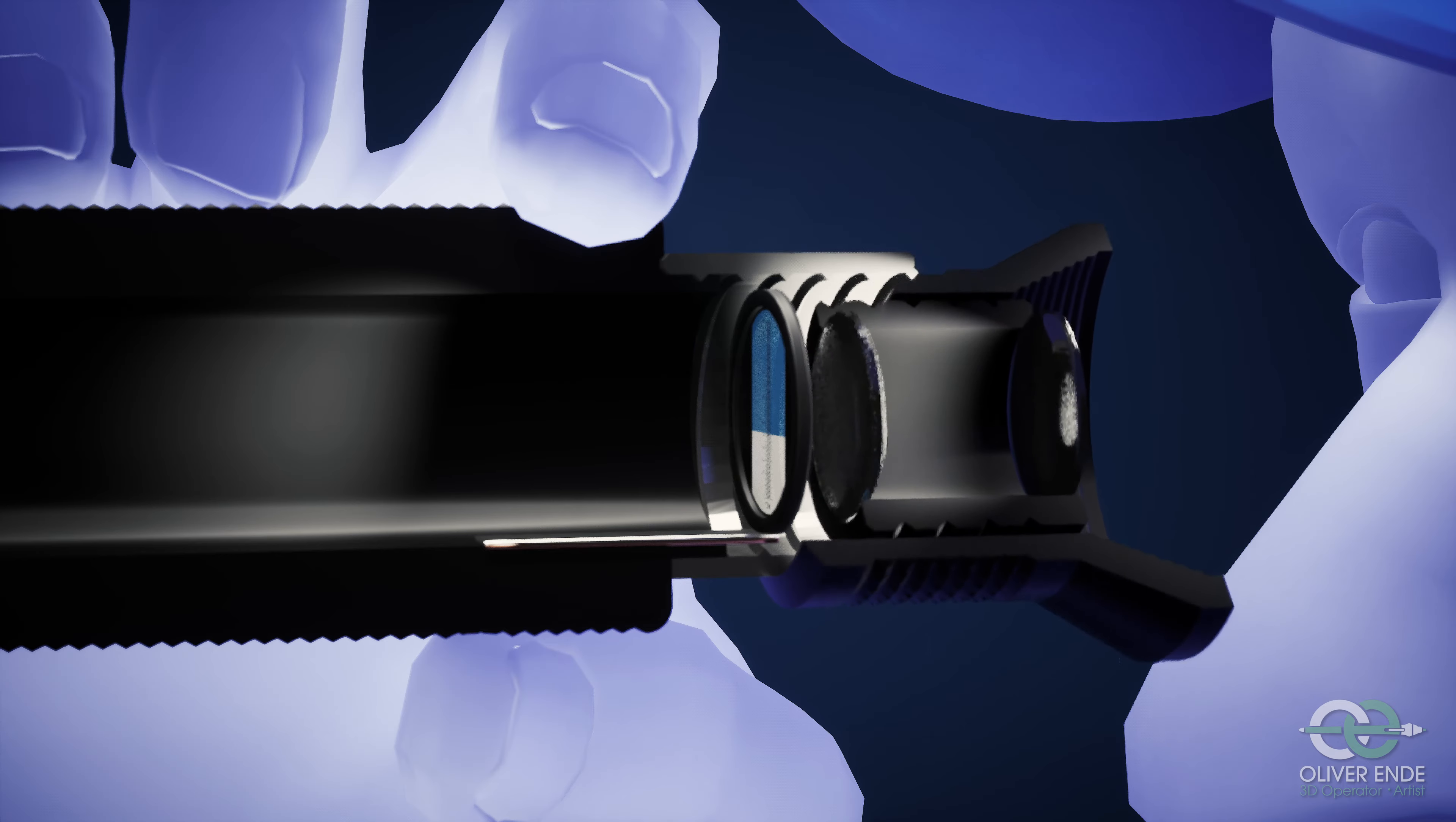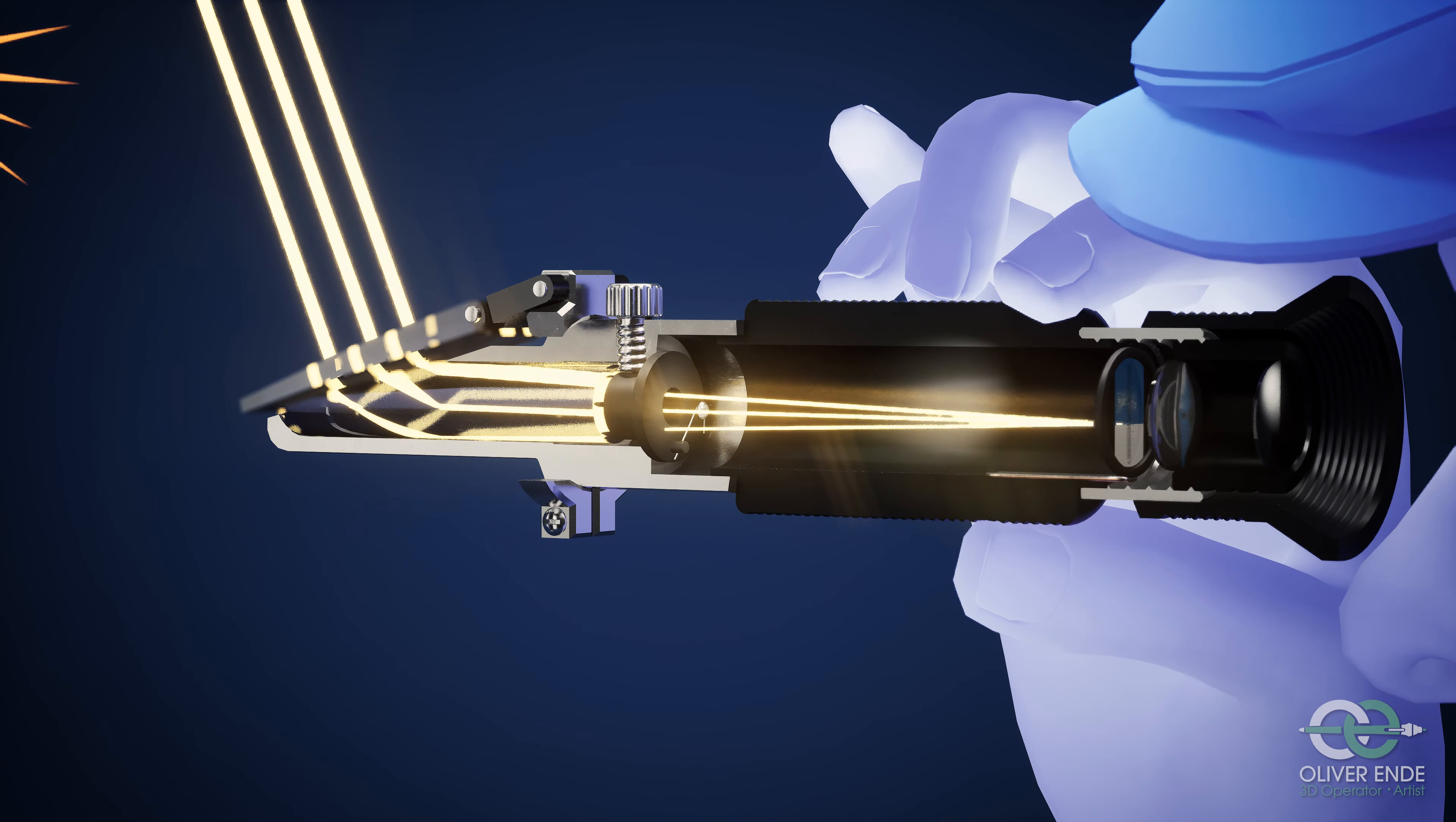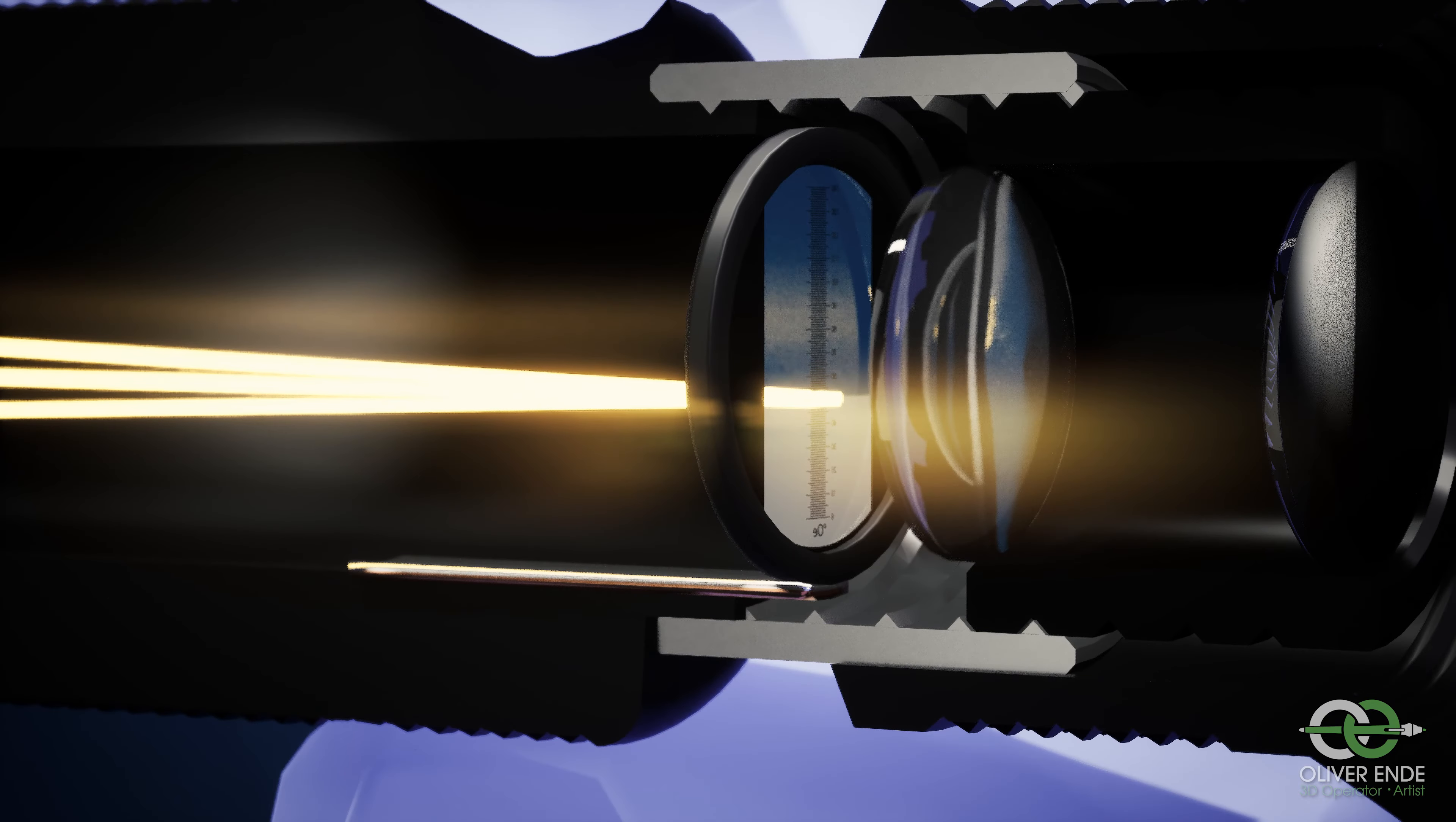The sun's rays are guided through the prism on the scale. Depending on the refraction, a blue area appears with a clear dividing line with a bright area below.